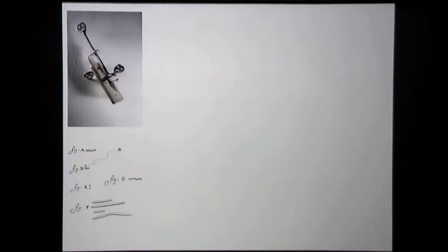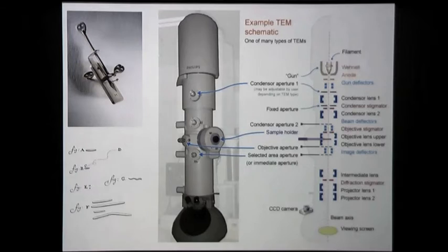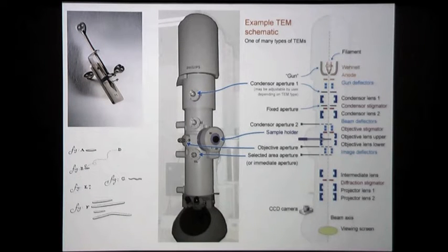However, obviously, with a microscope like this, or even with improved light microscopes that we have now, you're still limited in the degree of detail that you can image by the wavelength of light. So we need an electron microscope, where the effective wavelength of the electrons, because we can treat electrons as waves as well as particles, is no longer a limiting factor in terms of the fineness of detail that can be resolved. So we have a source of electrons of some kind, a gun, a field emission gun, or a heated filament. Some condenser lenses here produce a nice coherent beam at the specimen.